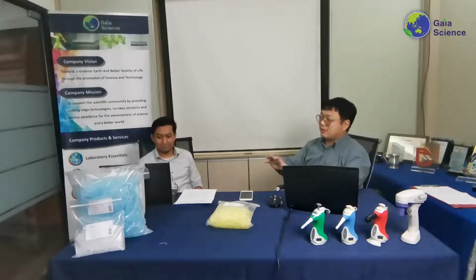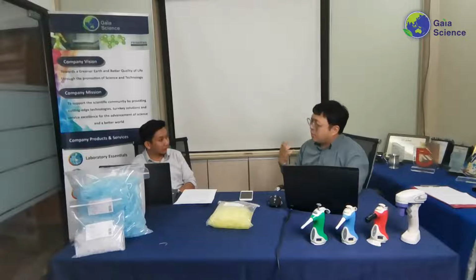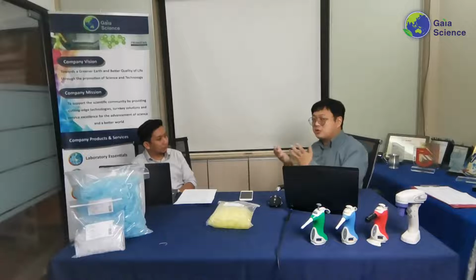Doesn't matter whether it is from China, made in the US, or even made in Malaysia. If you have different brands out there, most of them are made slightly differently, so they could be millimeters different. Even the raw materials that they use to make the pipette tips might be different as well, so there might be some variations in the final product. Although they're different brands and sometimes say they are universal, obviously they might not fit perfectly onto your pipette.